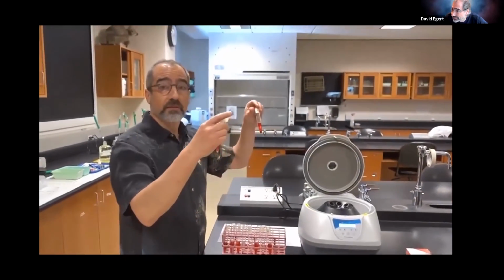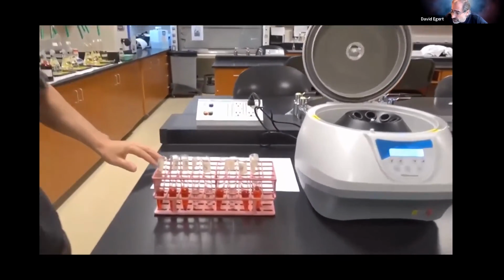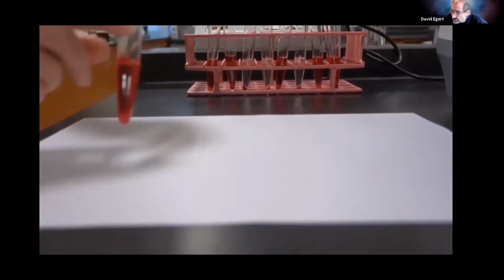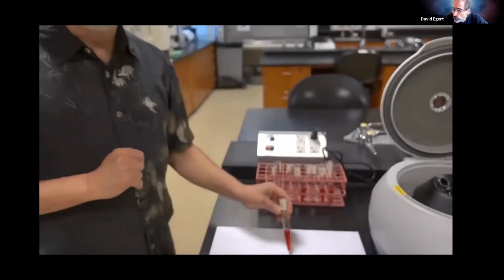All right, so we finished spinning down the last samples here. Now we can look a little closer at what happened. Again, the one that was in distilled water, basically osmolarity 0, this is the most hypotonic you can get. We can see the supernatant is bright red. And if you look for a pellet, it's really not a pellet, which is telling us that all the cells are popped. All we got are little shreds of membrane in there.